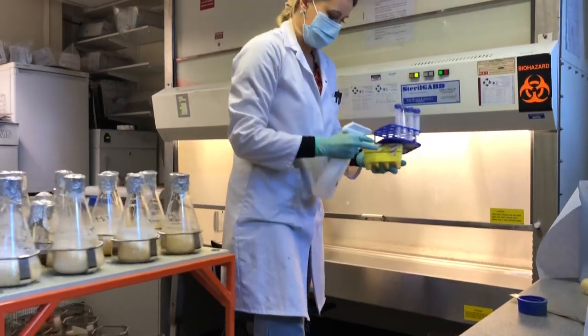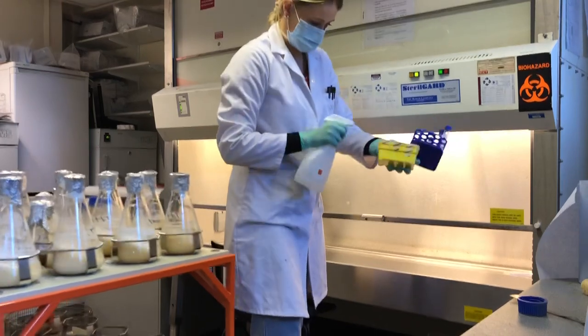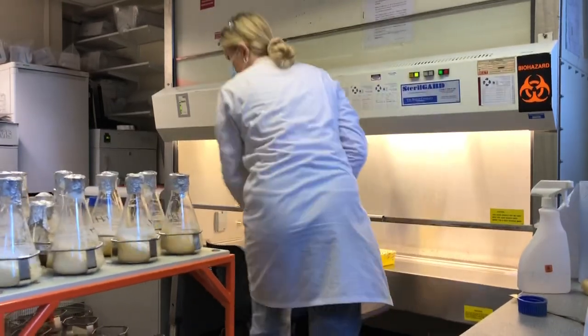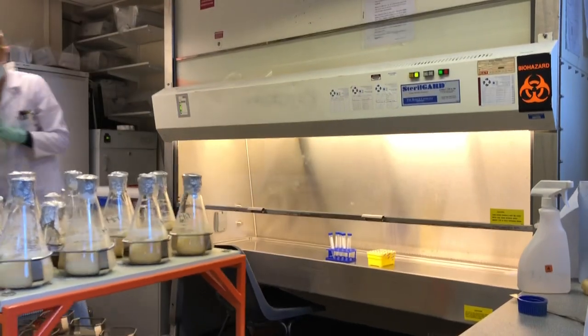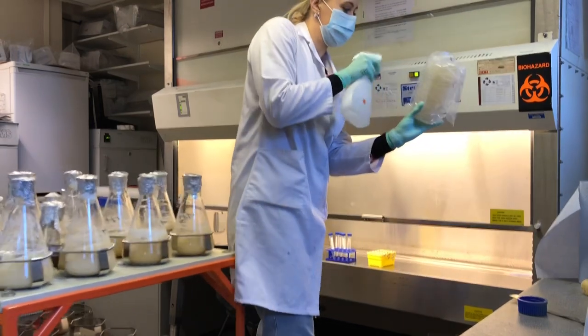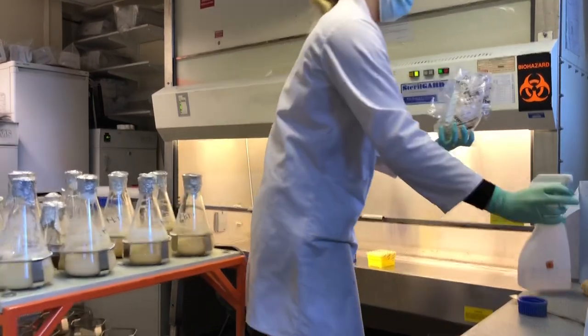I always spray down my equipment or any tools that I'm bringing into the clean bench as well, because you don't know what's living on them. Just to make sure that the surfaces are nice and decontaminated so that the things you bring into the clean bench aren't contaminating the rest of your samples.